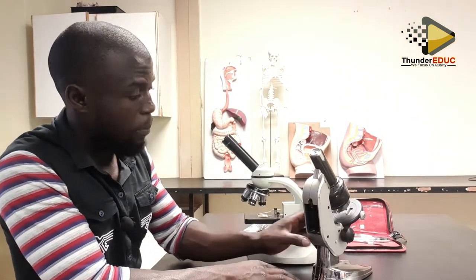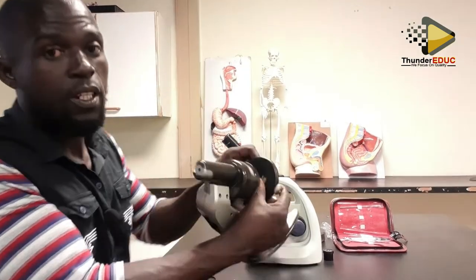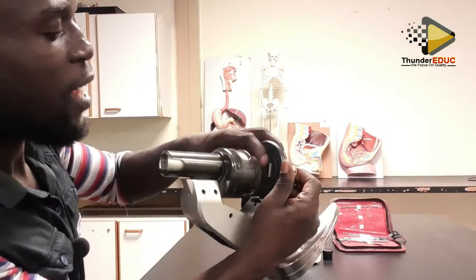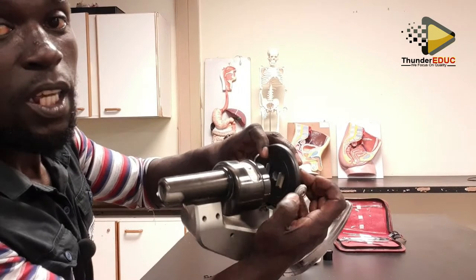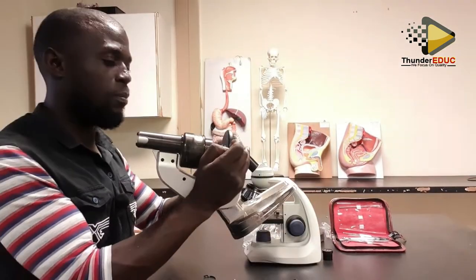Also, it has the batteries, they go here. And then it also has the slide. It has the clips. You put the slide here and then you release it so that it holds the slide in position. So it also has the clips.